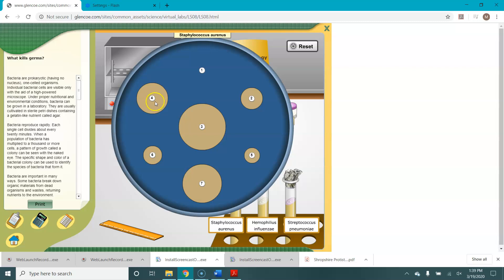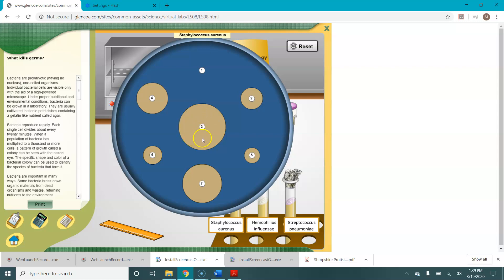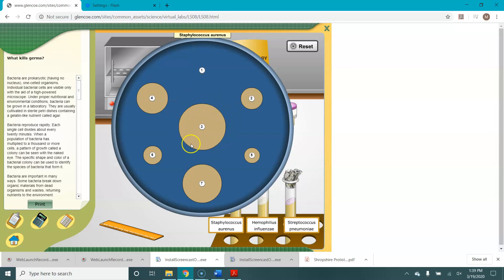These tan zones are then our zones of inhibition. These are places where whatever is on these discs, so in this case disinfectant, in this case bleach, these zones of inhibition are where those items have killed the bacteria. And the larger the radius around the disc, the more effective it was at killing bacteria. The smaller the radius, the more the bacteria was resistant to that agent.